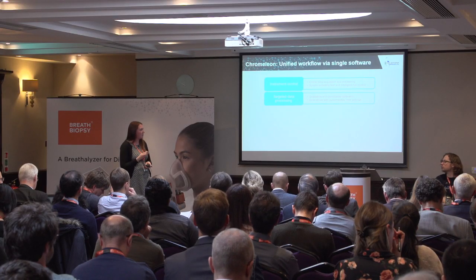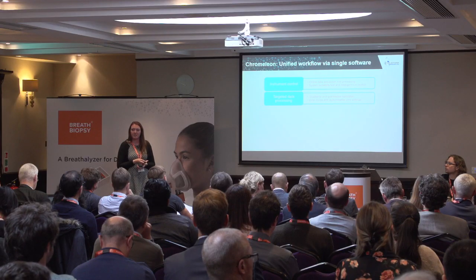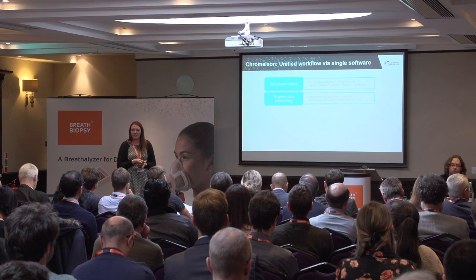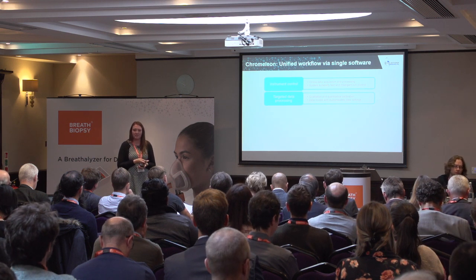Combining it with our targeted data processing, we can look for those targets, apply limits, and at point of analysis have those limits applied to the data. If something erroneous were to happen and the test fails, it will pause the sequence, preserving the breath samples from these sick people that it takes a lot of effort and consideration to set up and acquire.